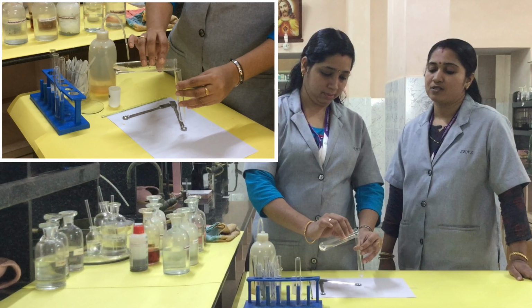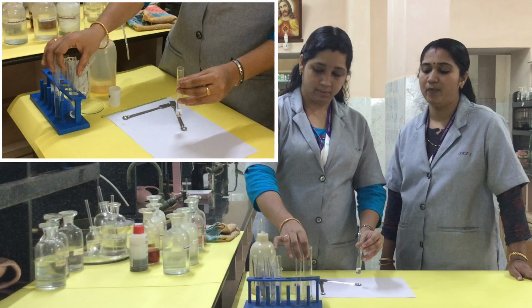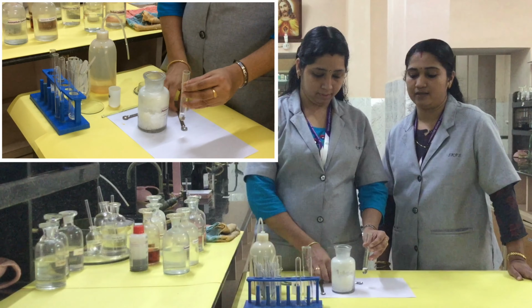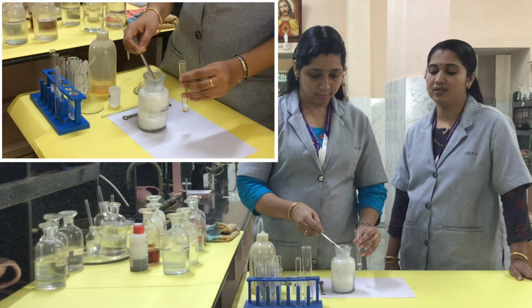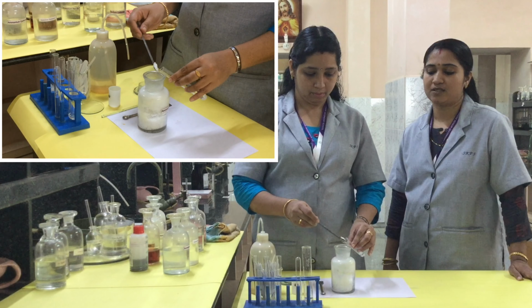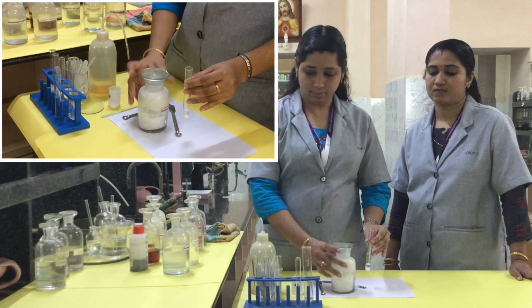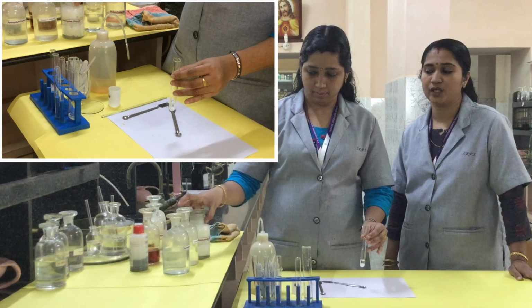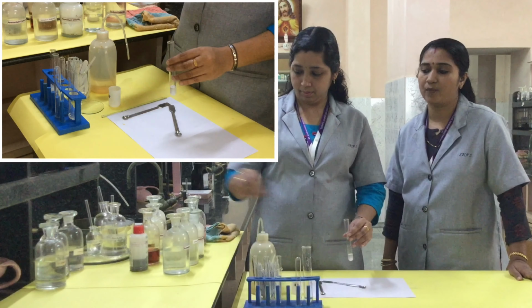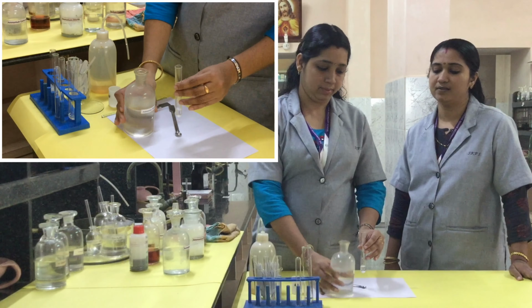For that, the salt solution is taken in a test tube and we again add solid ammonium chloride. Make the solution saturated. Just check it well. We are analyzing group 5. The group 5 reagents are ammonium chloride, next, excess of ammonium hydroxide. We are adding excess of ammonium hydroxide.